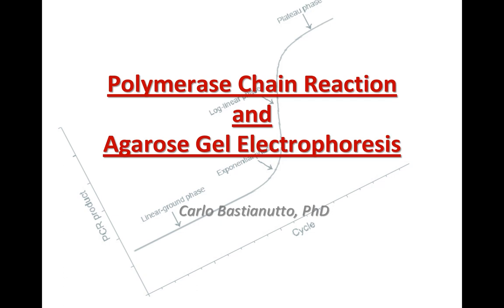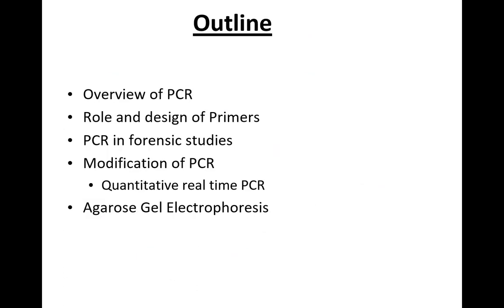And then I'll finish up touching a little bit on agarose gel electrophoresis, the reason being that you'll be using this in the lab in the next week. So these are the topics we're gonna touch here. As you can see, the main focus is on PCR. So first we'll go through an overview of PCR. We'll see how it works.